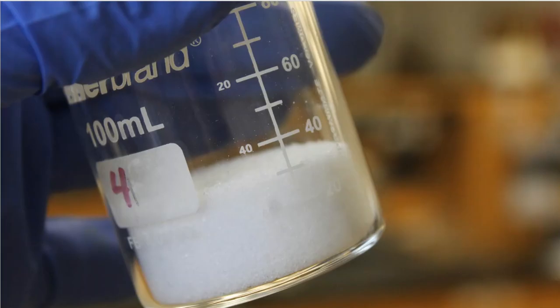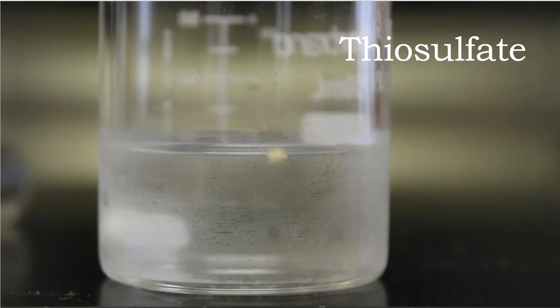If you take a look at how much I've actually put into a beaker, we can just eyeball it. You can look at this and say, you know, 7 or 8 different scoops, that's about it. And I'm going to add water to this, stir it, and let it sit. Okay, so in the meantime, I took a look at the thiosulfate solution that I made in the lab, and this is what the thiosulfate solution ended up looking like.